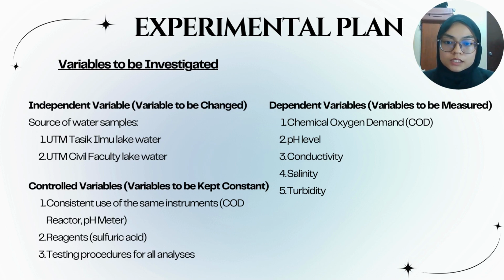So the first one is the independent variable, where we vary the source of water samples, which are the UTM Tasik Ilmu Lake water and also the UTM Civil Faculty Lake water. So the control variables is the consistent use of the same instruments, which are the COD reactor, pH meter, etc. And also we have the same reagents used for both sources of water samples, which is the sulfuric acid, and all the testing procedures for all analysis are the same.